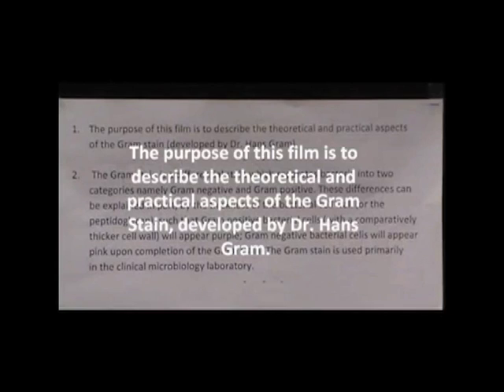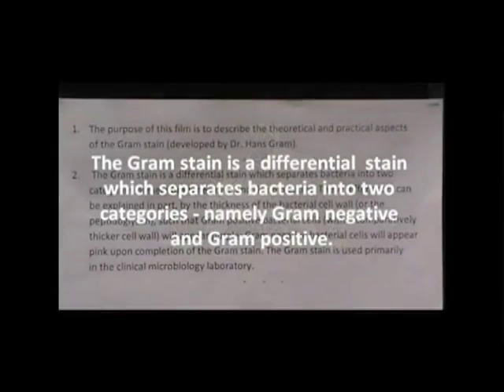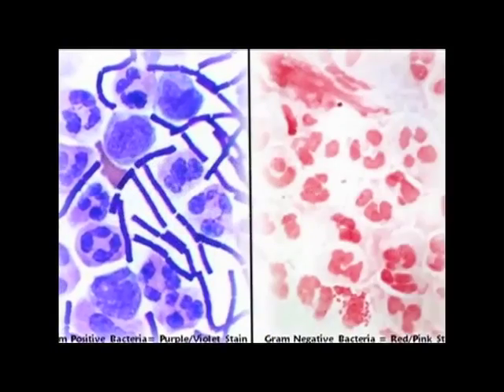The purpose of this film is to describe the theoretical and practical aspects of the Gram stain, developed by Dr. Hans Gram. The Gram stain is a differential stain which separates bacteria into two categories, namely gram-negative and gram-positive.